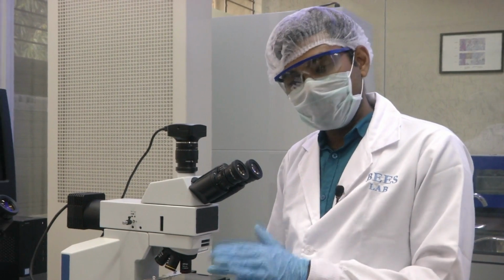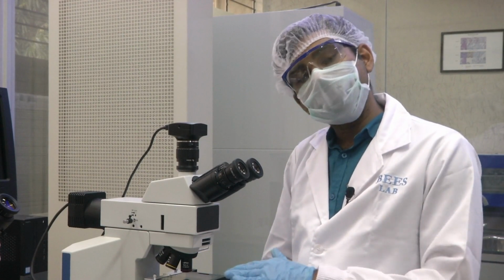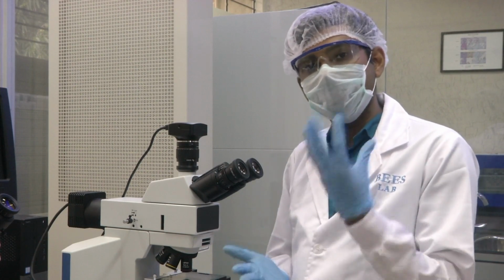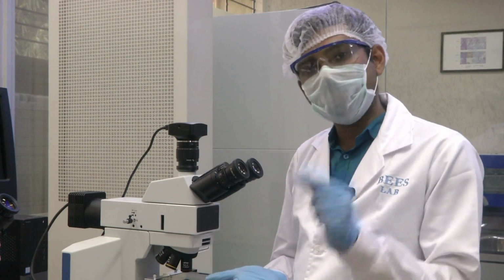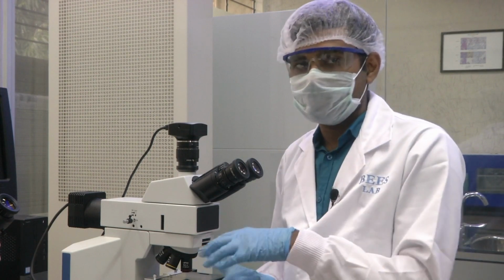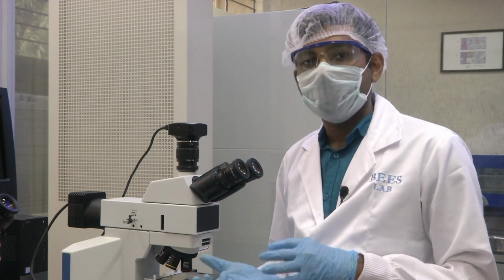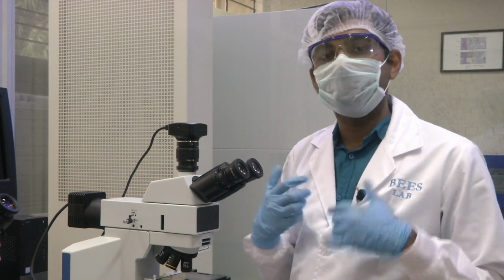So, let us say there is something called nuclear staining of cells. Let us say we have a petri dish containing a lot of cells, and we want to study how the cell's nucleus behaves. You all know the nucleus is the core part of a cell. What we do is, there is a chemical or a dye called DAPI. We add that chemical to the cells. What does this DAPI do? DAPI goes into the cell, goes into the nucleus, binds with the DNA that is there, and once that binding event happens, it starts emitting blue light.